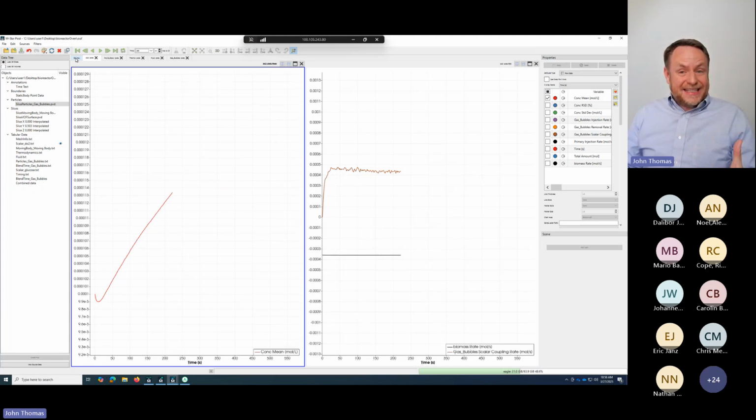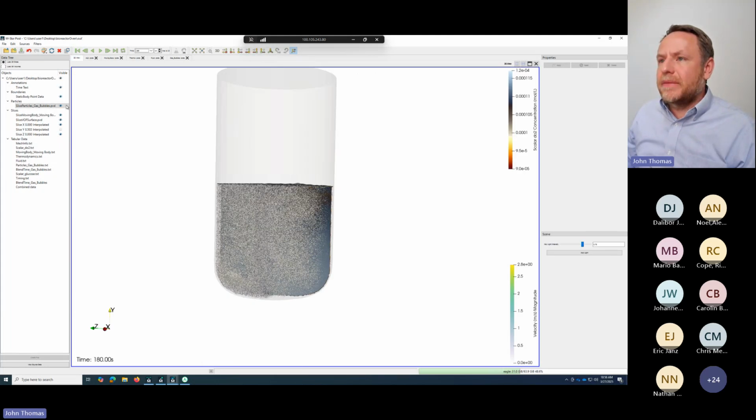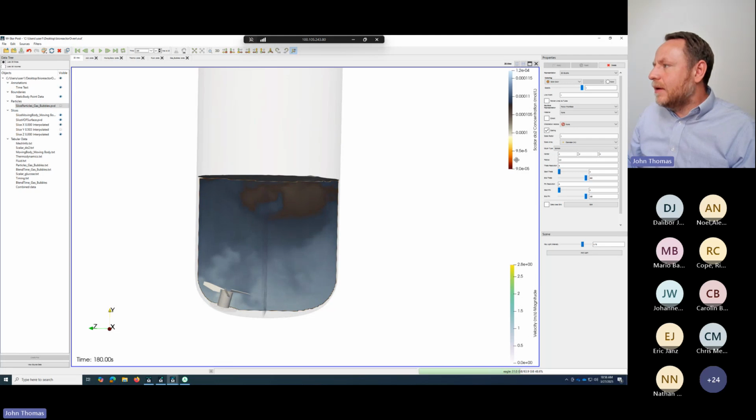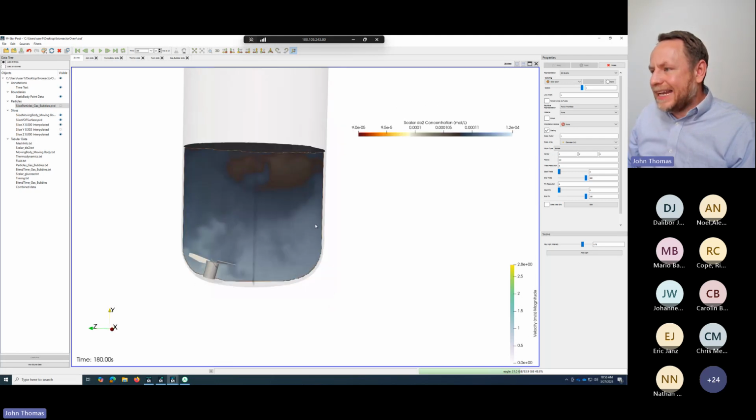As the code will get that. It'll get it. And as I go over to this guy here, let me turn the bubbles off. And in that process, I can see, for example, here is my DO concentration. I can see I've got high concentrations there and a region 30% lower up here that's just standing inside the vessel as I compete between transfer and consumption.